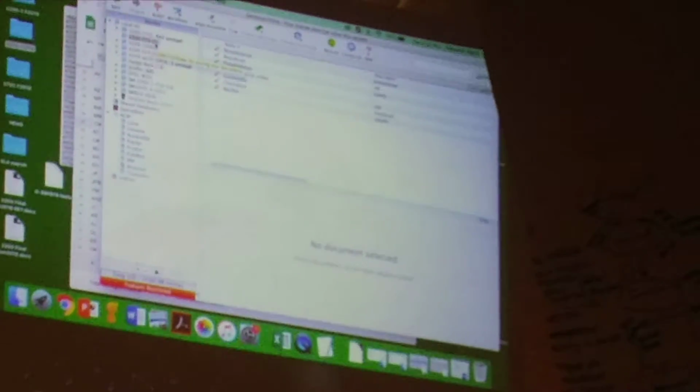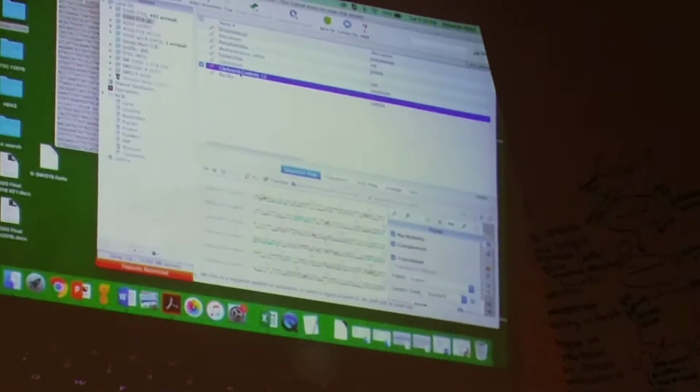Okay. So now I'm back in my 3300 Fall 19 folder, and I have 7 sequences. You'll see the number 7 right here to tell you how many are in there. Now you can paste that sequence that I gave you right in there. It's going to be called Clipboard Contents, and you can rename it My Soil Isolate.